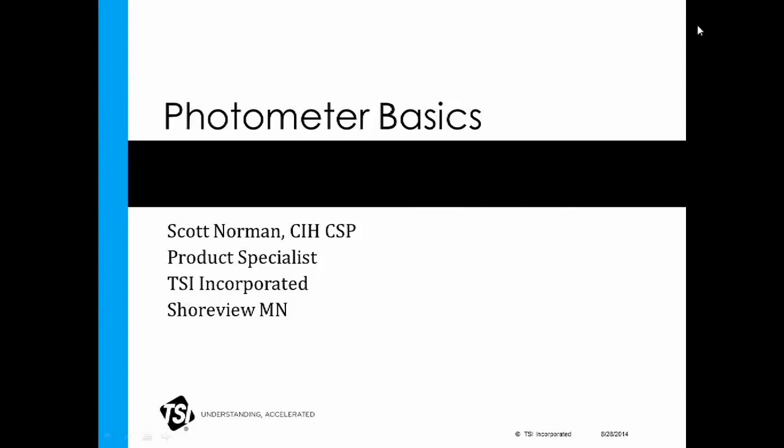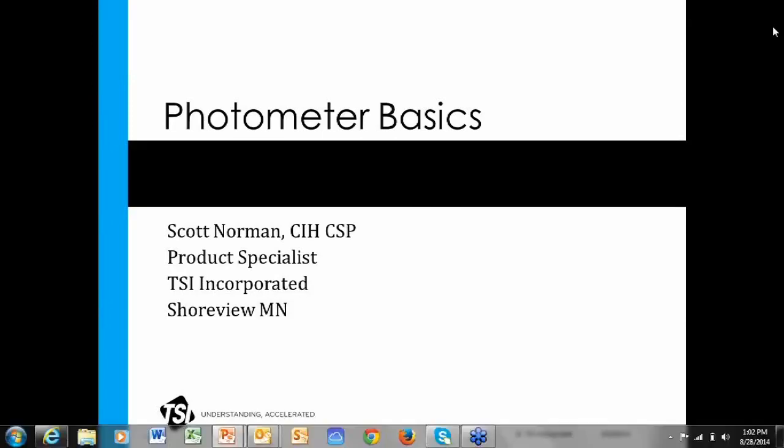So, photometer basics. Today we're going to cover how light scattering photometers work to measure aerosol mass.